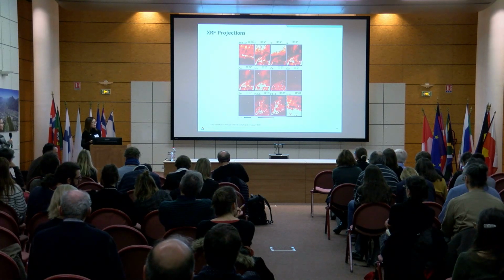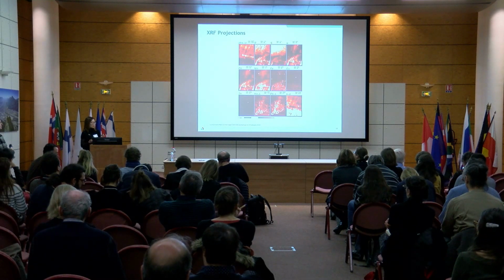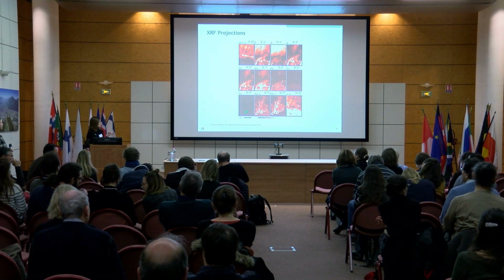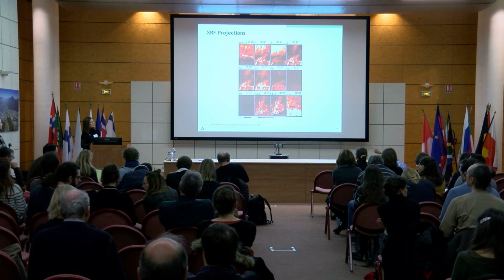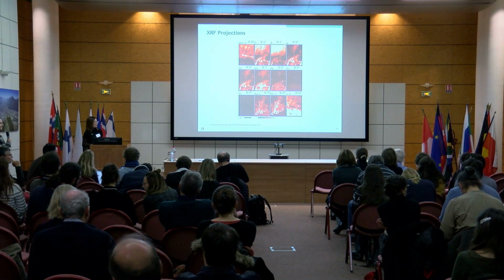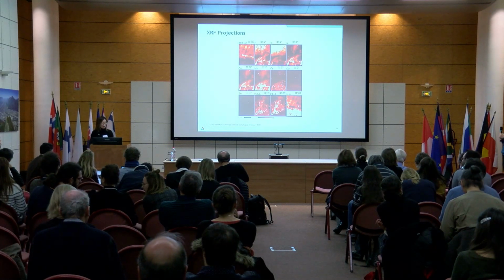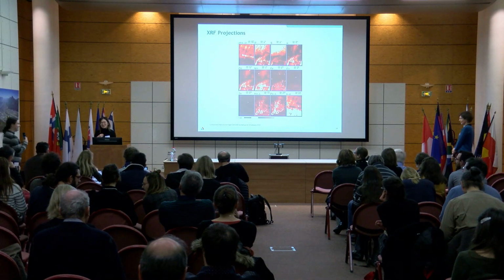Right, it might be difficult to tell if it's lead carbonate or phosphate or sulfate. But this way, at least we can use the lead signal to read the letter. Then we should go to diffraction, because the energy is high, so it has a much stronger penetration power. Okay, I think we need to move on.